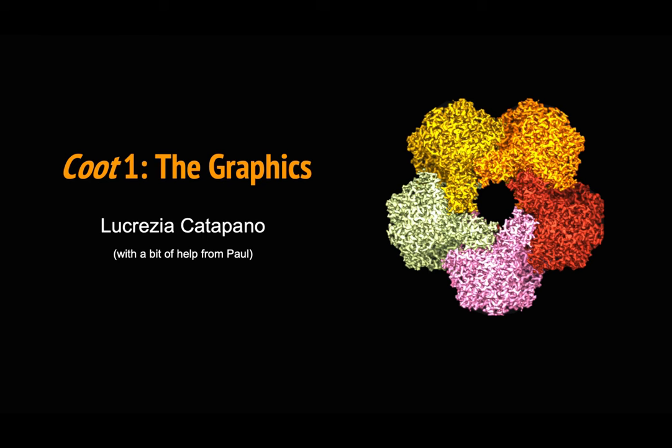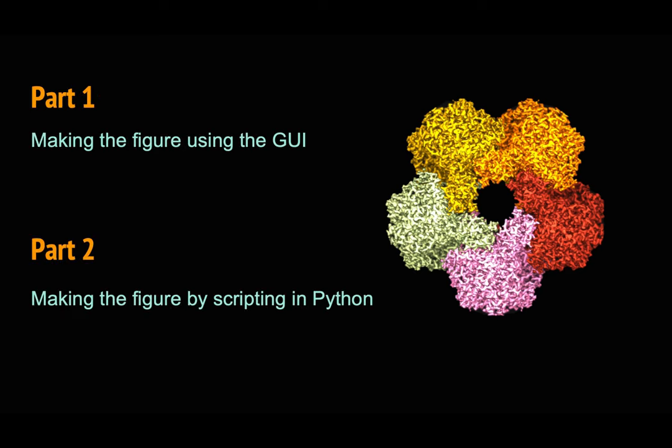Hi everyone and welcome to the second Coot tutorial on graphics. Today we are going to explore the new graphics feature in Coot. This tutorial is divided in two parts.